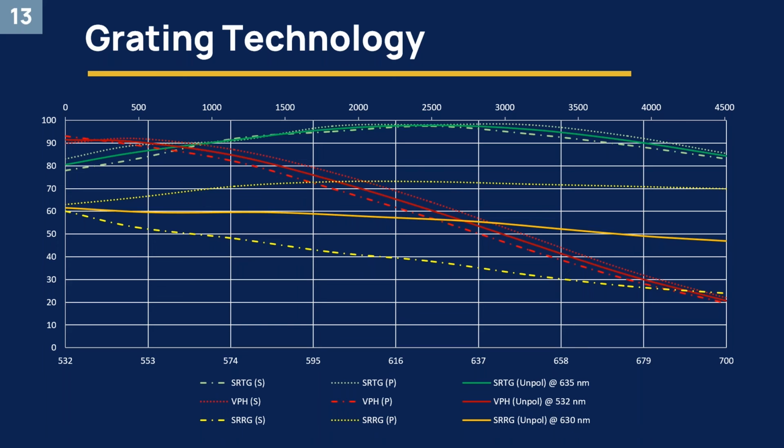You can see here that it starts out very high at 90% efficiency, but it drops down quite quickly, and it actually ends up around 20% efficiency for this theoretical design. That's due to the gel itself essentially having to be thicker, because of the lower change in the refractive index.